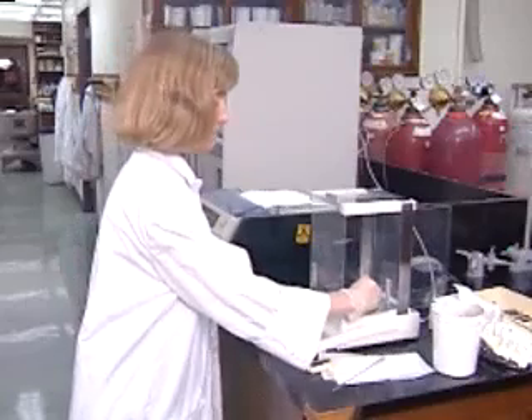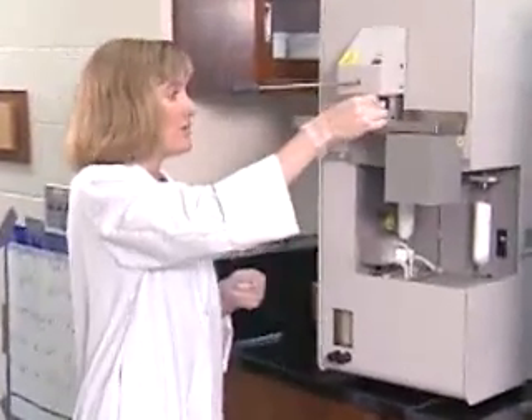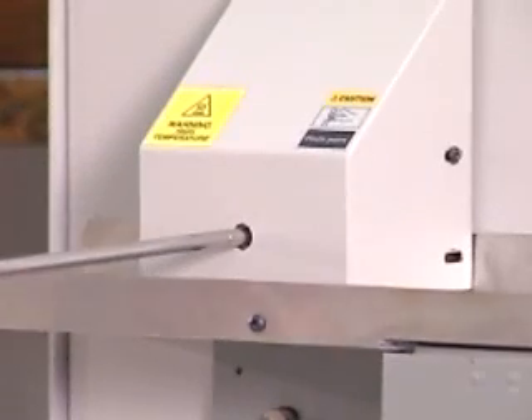Remove the sample from the balance and then move to the analyzer. We open up the furnace door, place the sample inside. The machine is now purging. After it is purged for a few seconds, we push the boat into the furnace.